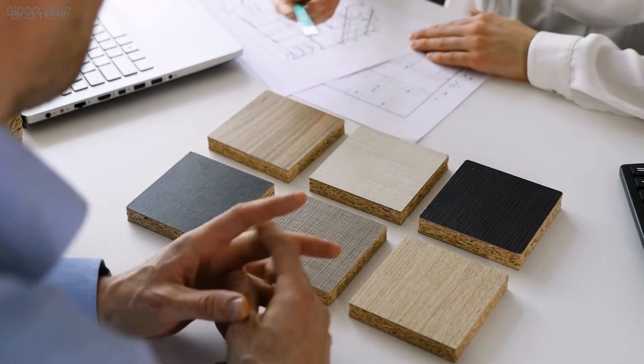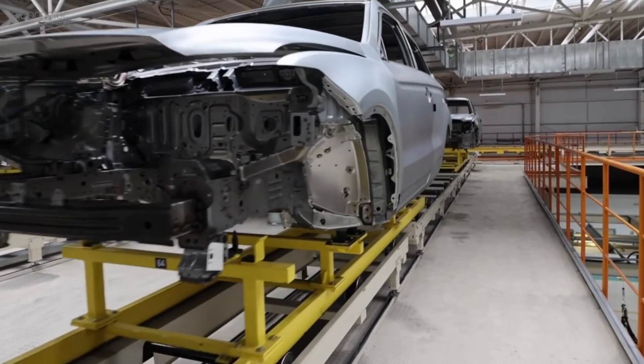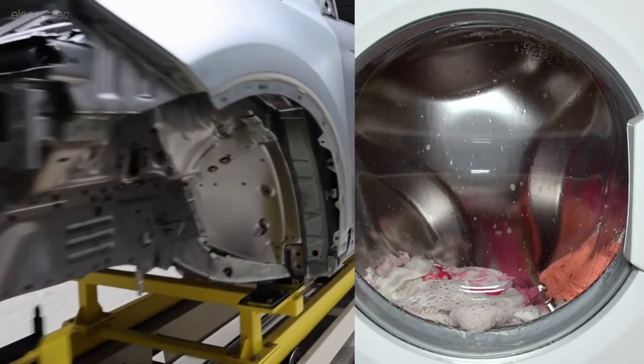In fact, almost everything around you will go through a durability cycle, some being longer, some being shorter. It is a crucial requirement that manufacturers test their product's ability to resist wear, in order to guarantee a long lifespan and good quality for their product.